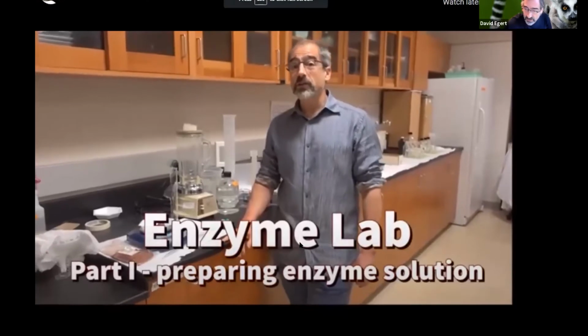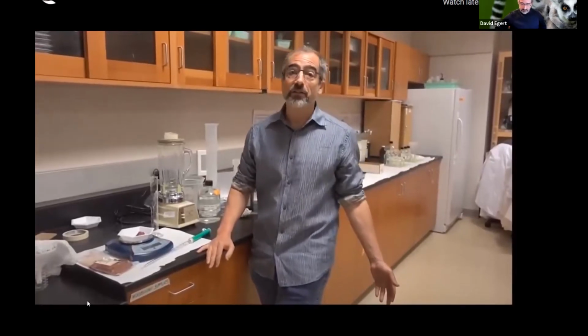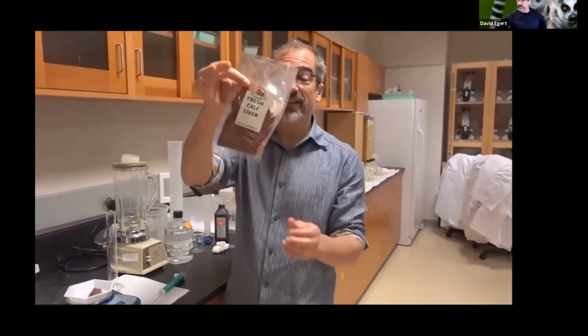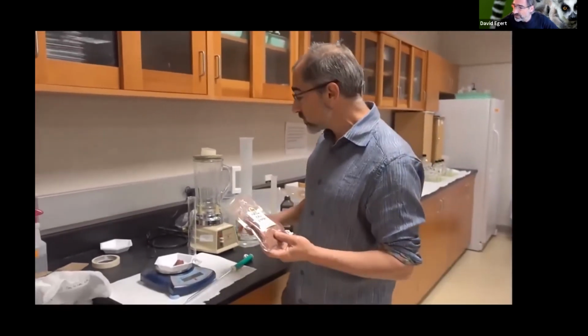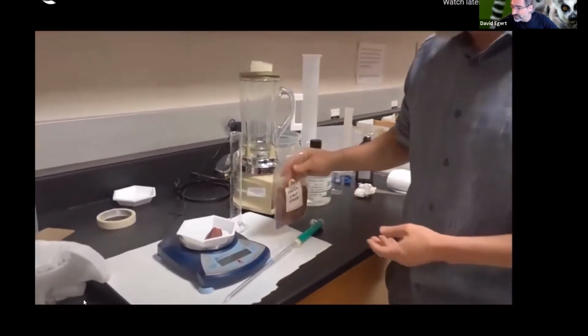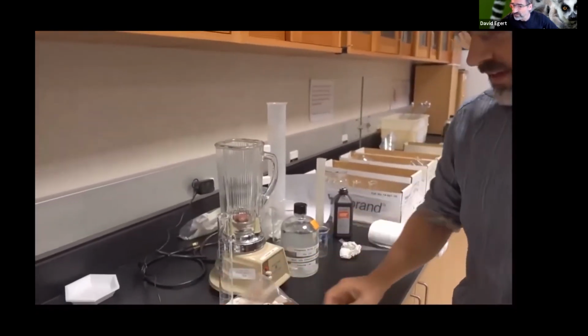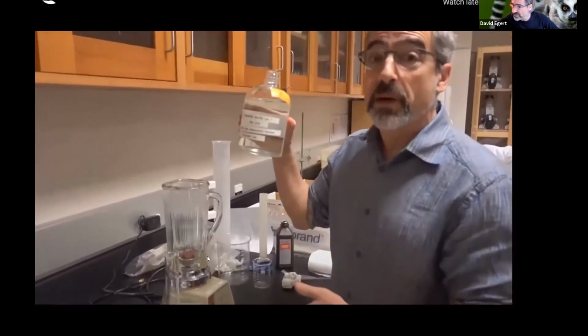All right, so lab, we obviously are going to need a source of our enzyme, our catalase, which is going to be in all of our trials to decompose the hydrogen peroxide into oxygen and water. And the source of our catalase enzyme is going to be the liver. So to prepare our enzyme solution, here I've weighed out 15 grams, more or less, of fresh calf liver. I'm going to take it and put it in a little blender here. And we're going to add 100 mils of this phosphate buffer.